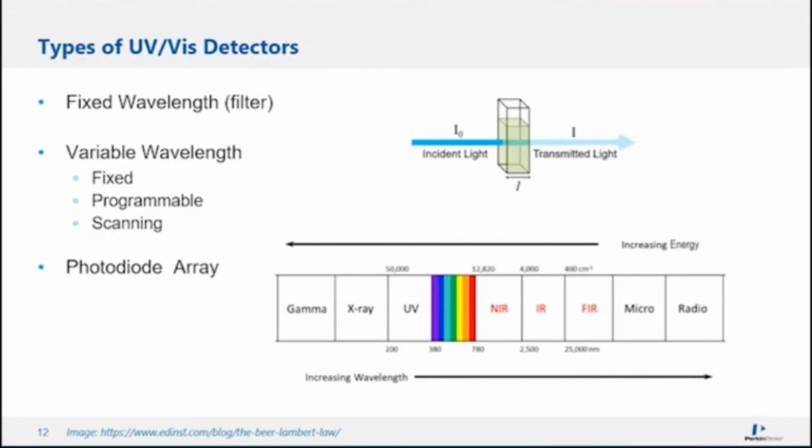The first detectors we will look at are UV-Vis based detectors. They measure the ability of solutes to absorb light at particular wavelength or wavelengths in the ultraviolet (UV) or the visible (Vis) wavelength range, from around 190 to 790 nanometers. In general, the mobile phase has a limited measurable response within these ranges, and gradients can be used.